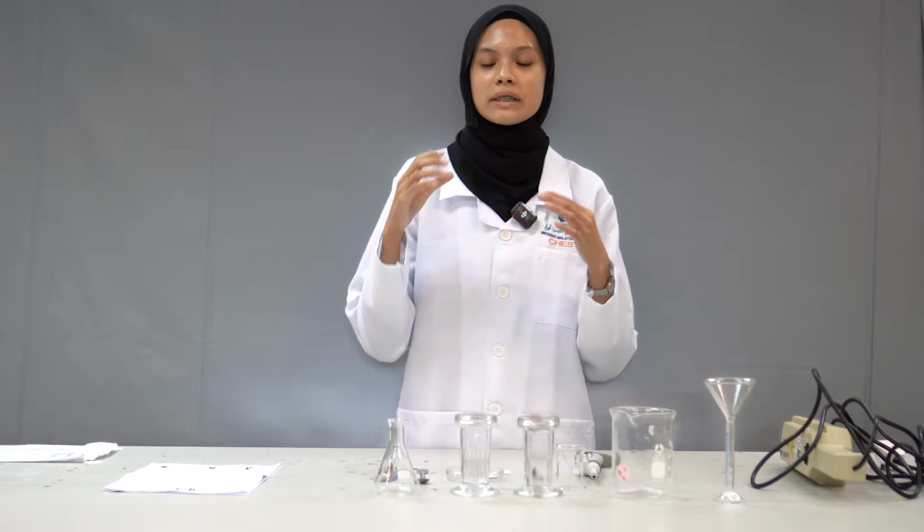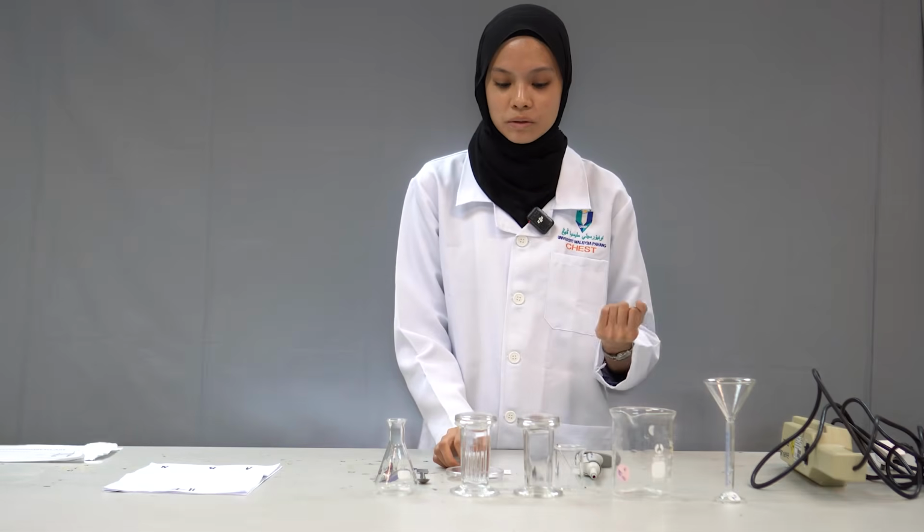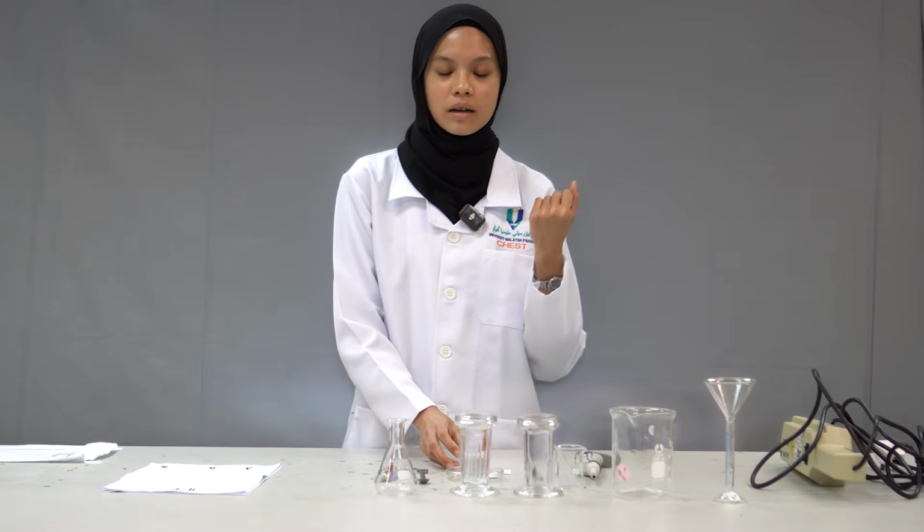The RF value is the retention factor, which is the ratio of the travel distance of the compound to the travel distance of the solvent. To get accurate separation efficiency, we have to choose the optimum solvent.